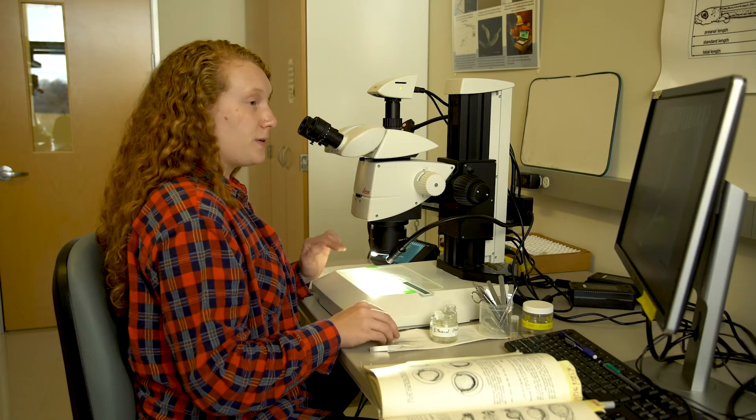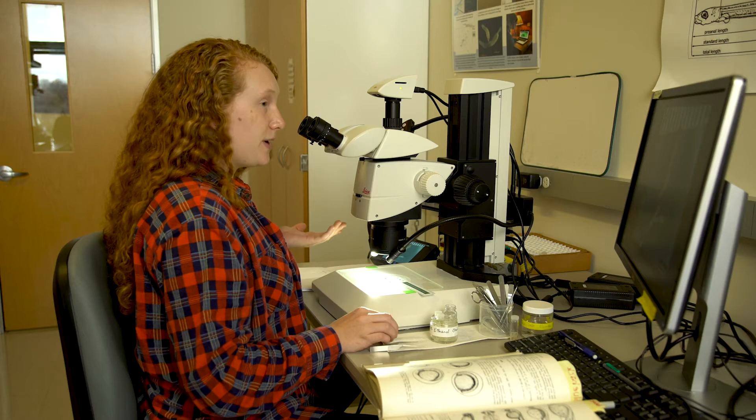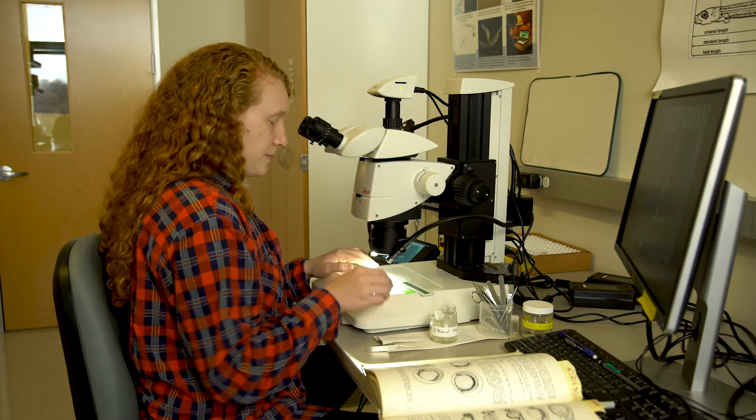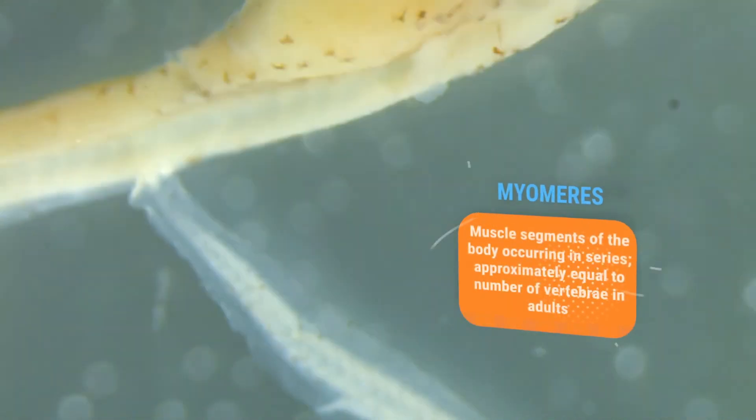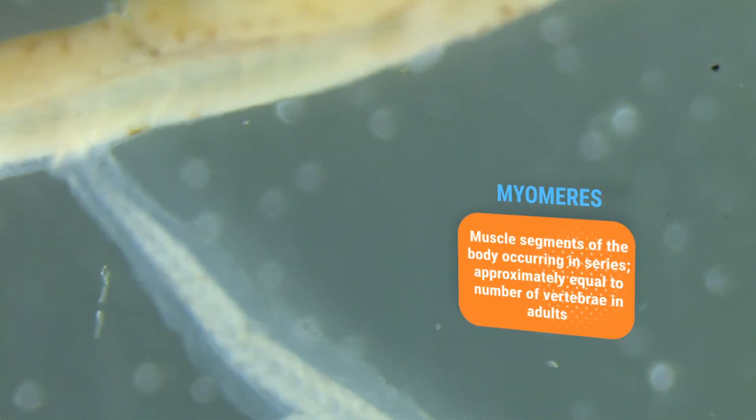So once you have the vent located and you can identify to family, then we can go a little more specific. We can start with myomeres. Myomeres are your second most important identifier. A myomere is a V-shaped muscle fiber. It's what makes up your muscles. And because these fish are so small, it is their muscles.